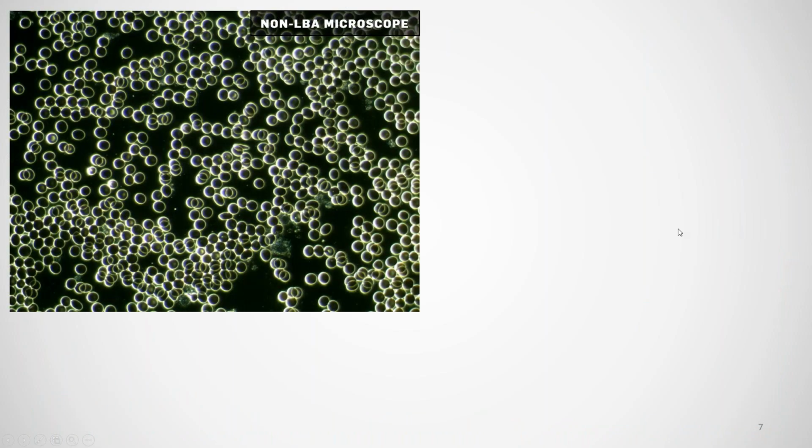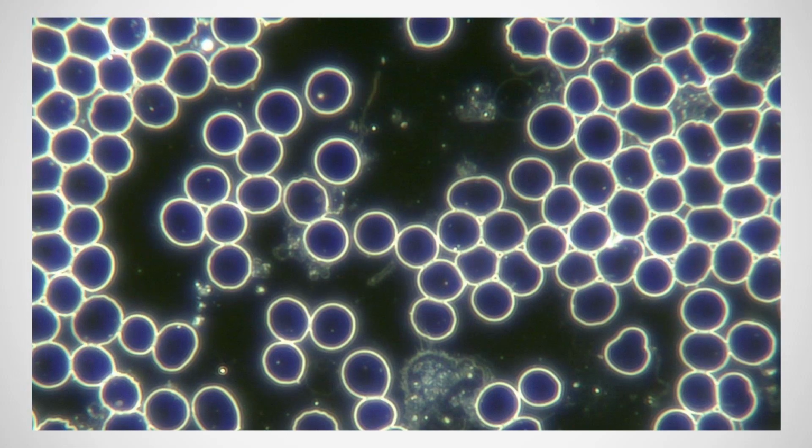And what are ghost cells? Let's go back to that image there. Ghost cells are actually, well, there's one here, just a red blood cell that's really quite faint. We can see the example just adjacent to these thrombocytes here. And it's just red blood cells where the contents have actually leaked out, also called hemolysis cells or lysis, usually related to things like vitamin B12 deficiency and problems with the actual cell membrane.